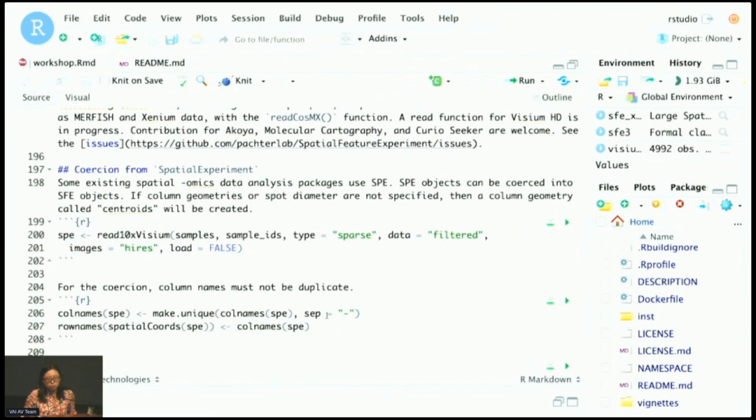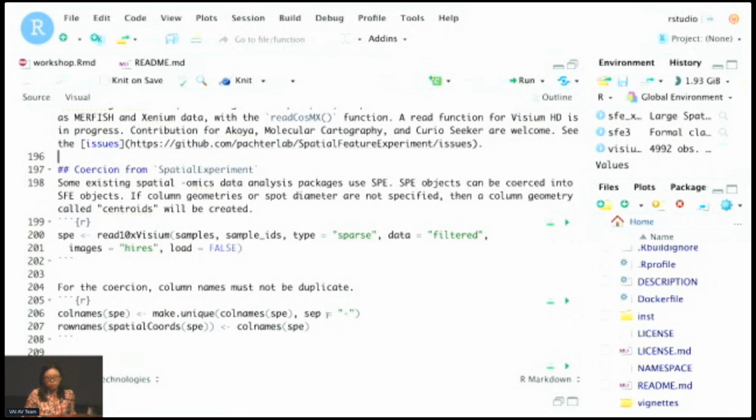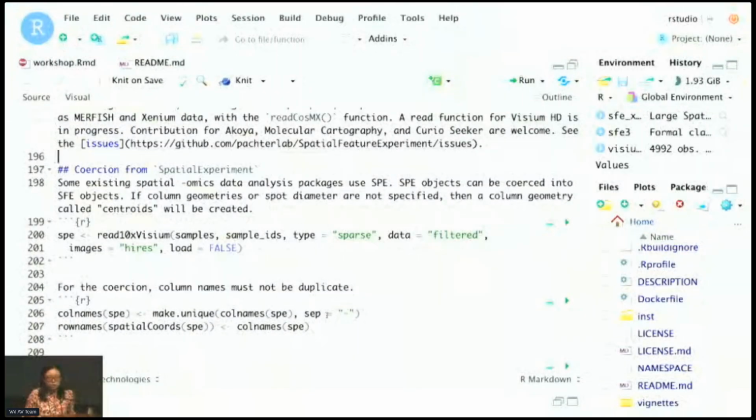So basically, in SpatialExperiment, you just have a matrix for the x, y, and sometimes z centroid coordinates, but that's just a matrix. But for SFE, you can put centroids in the colGeometries, and because it's sf, simple features, you can use geometrical operations to see which cell has a centroid within a spatial region, or within a spatial bin, or a histological region.